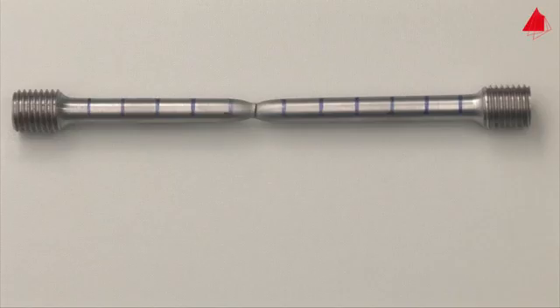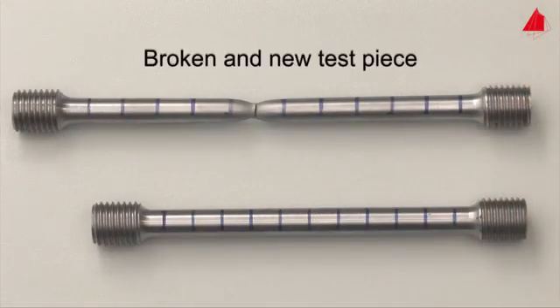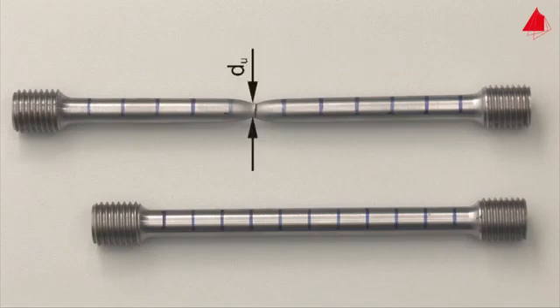With the help of the distance marks, the percentage elongation after fracture can be determined. This is the permanent strain after fracture and amounts to about 30 percent in this example. Please note that the percentage elongation after fracture depends on the length to diameter ratio. By measuring the smallest diameter at the point of fracture, the percentage reduction of area can be calculated. It describes the reduction of cross-sectional area at the point of fracture in relation to the original cross-sectional area.